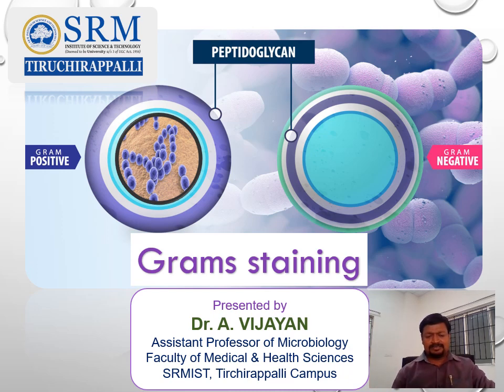Hans Christian Joachim Gram, Danish biologist, bacteriologist and physician, developed the gram staining technique in 1883 and published the findings in 1884 in the Fortschritte der Medizin journal.